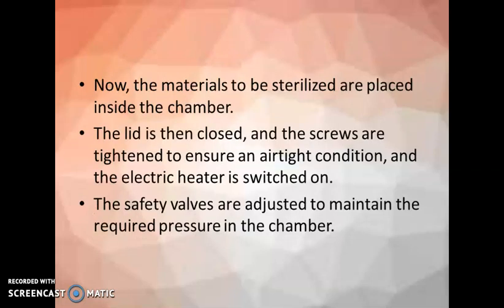Now the materials to be sterilized are placed inside the chamber. Then the lid is closed and the screws are tightened to ensure an airtight seal.